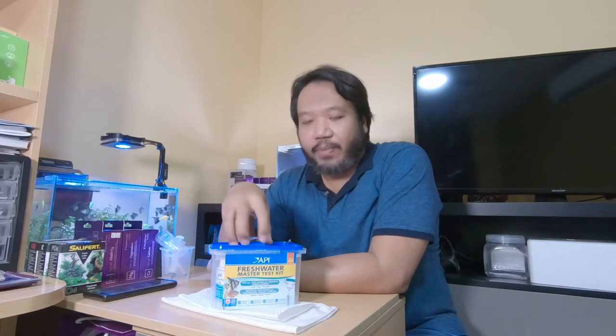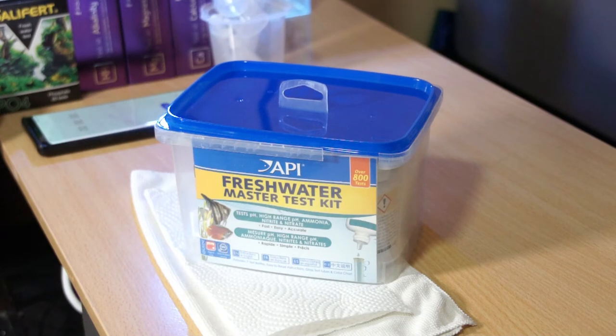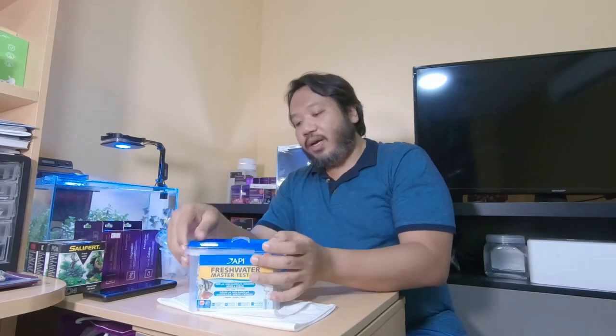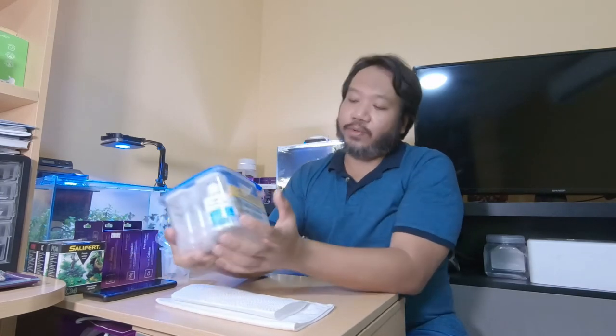Today we're going to go through the API test kit. API is a very common brand and well known for their test kits. I find that the API test kits are the easiest to use — not necessarily easiest to read, but easiest to use because it's very straightforward. Just a couple of drops into your water and test tube and it's done. The API kit comes with five tests: two for pH, one for ammonia, one for nitrite, and one for nitrate.